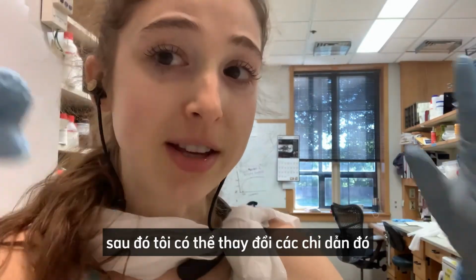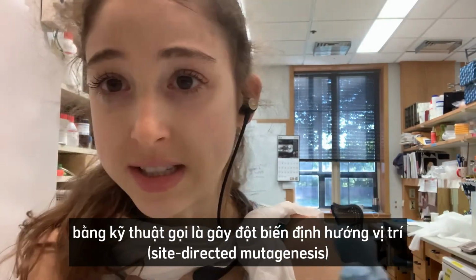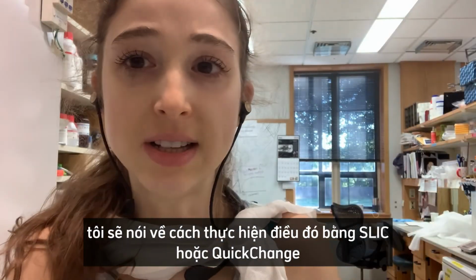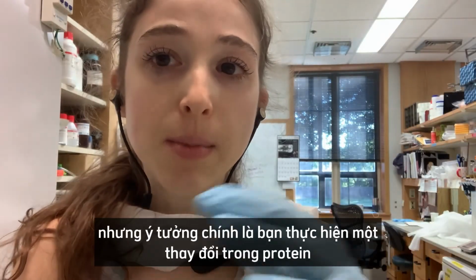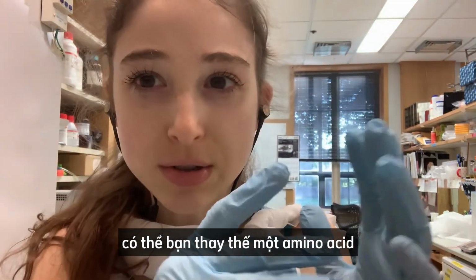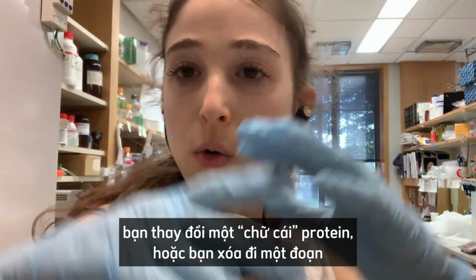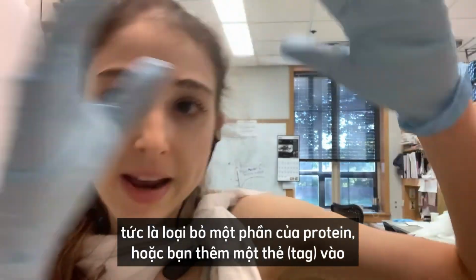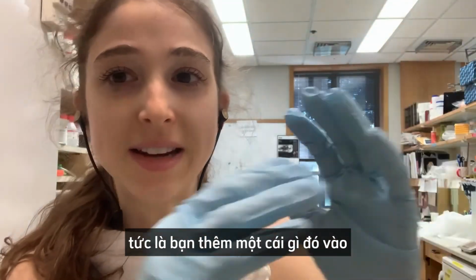And then I can make changes to those instructions using a technique called site-directed mutagenesis. I'll talk about how we do that using SLIC or QuikChange. But the idea is that you make a change to the protein. So maybe you do a substitution, where you change a protein letter, or you do a deletion, where you remove a section of a protein, or you add on a tag, so you're adding something.